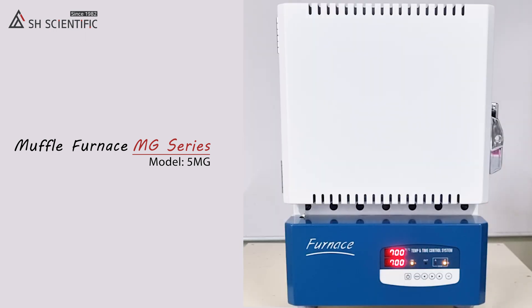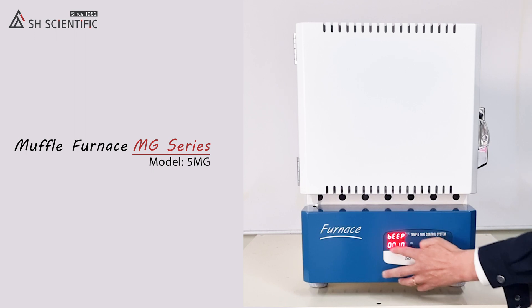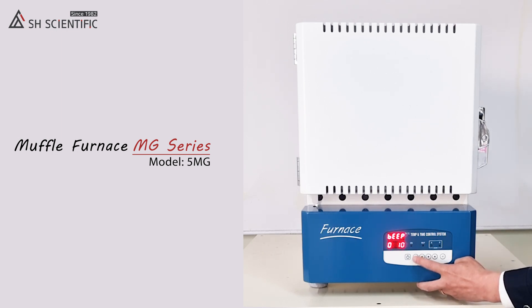By the way, you'll hear a beep like this when the time is up. Here's how to set the duration of that beep. All the digits here are in seconds, not hours or minutes. I am choosing 110 seconds.